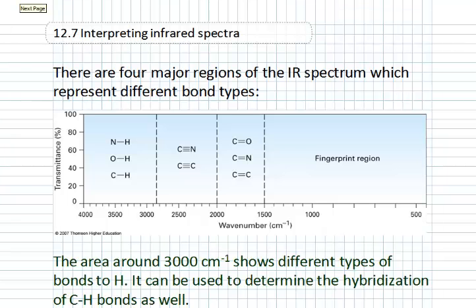In an IR spectrum, the scale sort of goes backwards again because it's in wave number. I guess it's the inverse of actual wavelength. Back long ago, the spectrum used to have wavelength on the lower axis, but doing it that way tends to emphasize the wrong thing. It's an inverse scale, and the wrong area is spread out.